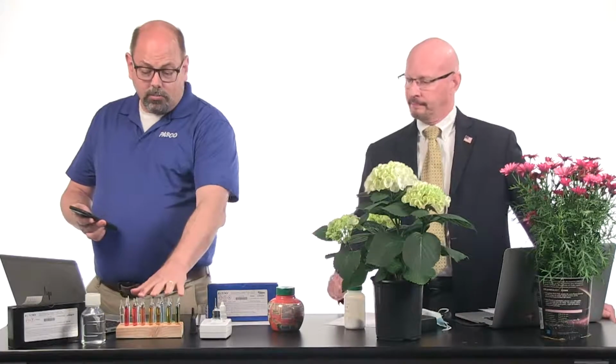That's correct. And we're able to measure at that level. Correct. With this kit here. Yes. Most places it'd be rare to run into those, except in those kinds of growing areas. Generally, the chemistry that goes on here measures up to about 4 parts per million, because that's where the chemistry is most stable. But with the instrument, as opposed to just looking at it by eye and color comparing it, we can extend that range a little bit. So there is an optimum range, which is 0 to 4 parts per million, and our spectrometer does extend that just a little bit.